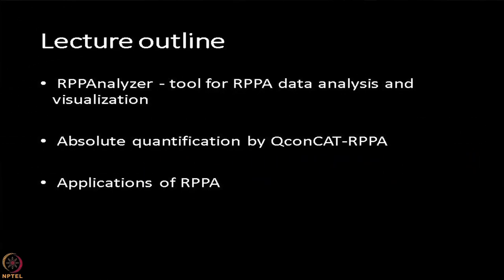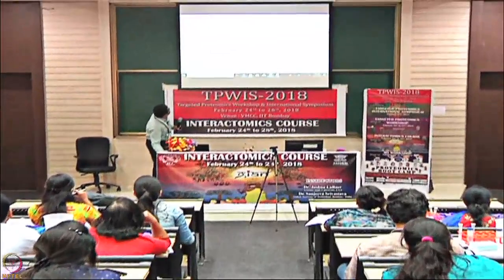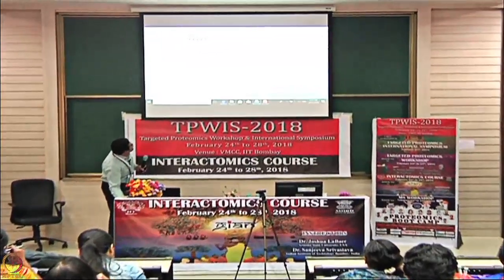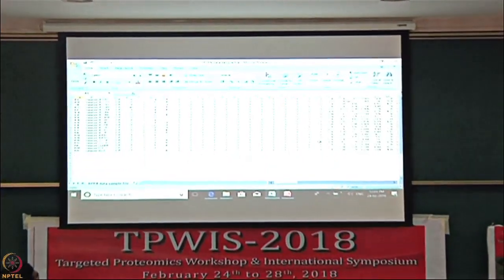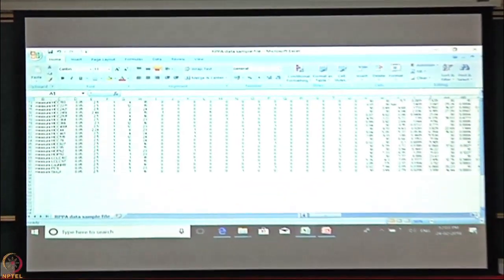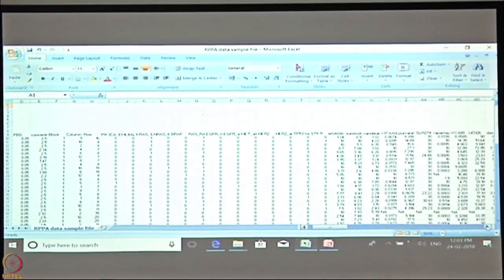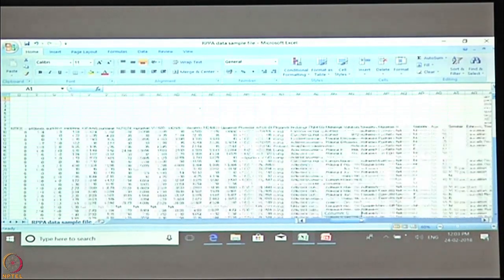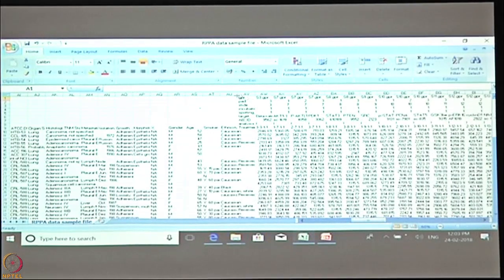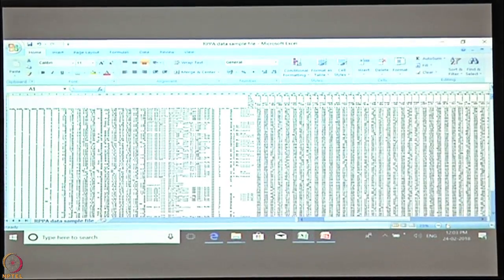I will show you what kind of data we have generated. So, here let us say, for example, these are the different samples, these are the different mutations in the cell lines. So, you can see that this is the data we could generate. And the drug resistance can be incorporated here. So, this kind of numbers you will get. These are the target names. So, your complex matrix will be like this.